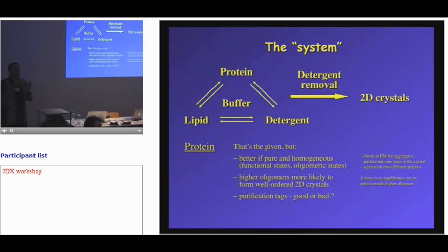It has a kind of building block shape. So if you have a tetramer, it's very likely that you make one tetramer next to the other, and you're not going to make a trigonal crystal.